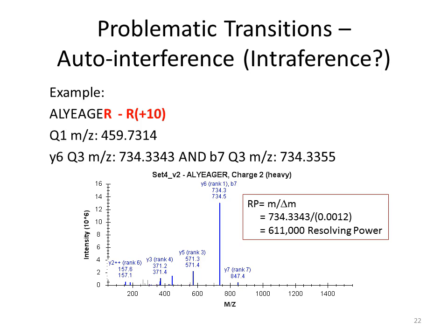Not that their sequence is a palindrome, but when you generate fragment ions from a peptide, sometimes a Y ion and a B ion will have the same mass to charge. And because they're coming from the same thing, then they will both give you signal at that mass to charge, which is not usually a problem if you're identifying a peptide. But if you're comparing it to a heavy form, well, that heavy form now doesn't have that same BY interference issue, because usually the Y product ion will be heavier. So you need to make sure that this isn't happening to you.